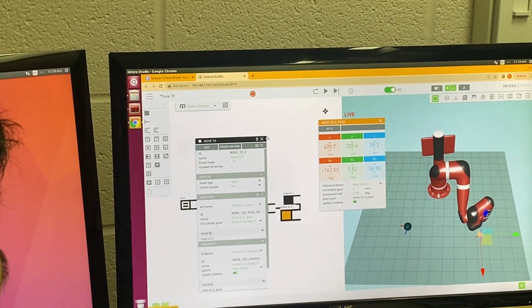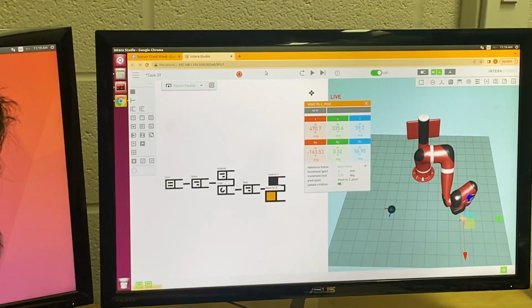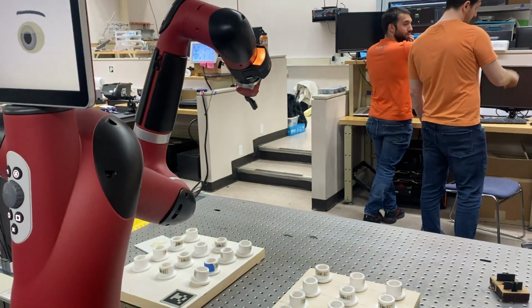Ooh, it has 2 of those. So just a simple example. And then if we run it, interesting. It should just go between the two. Back down.